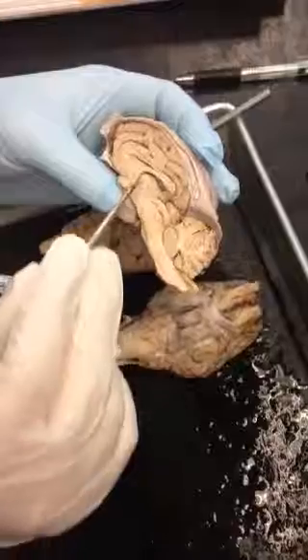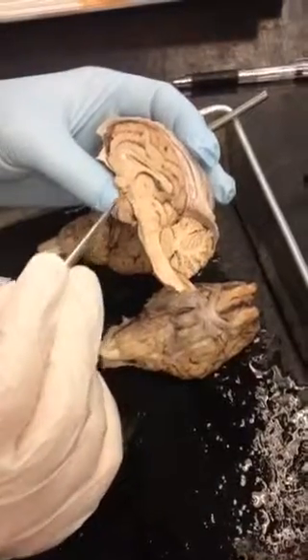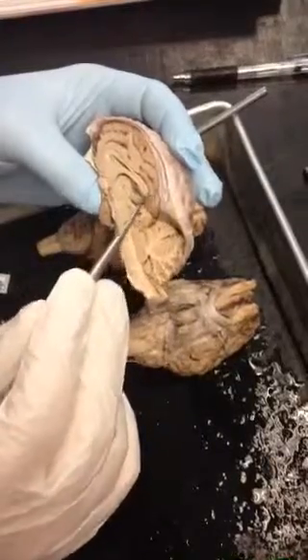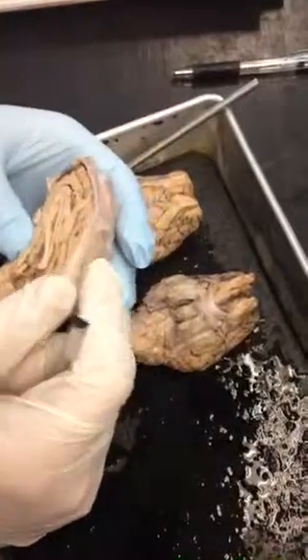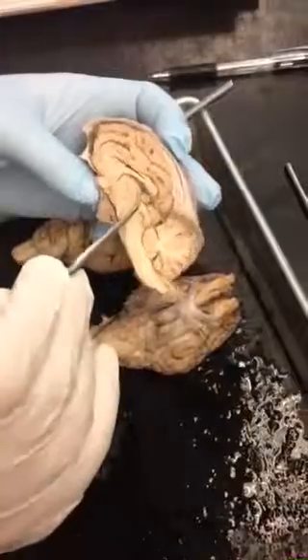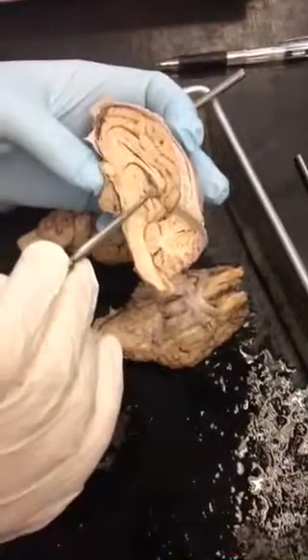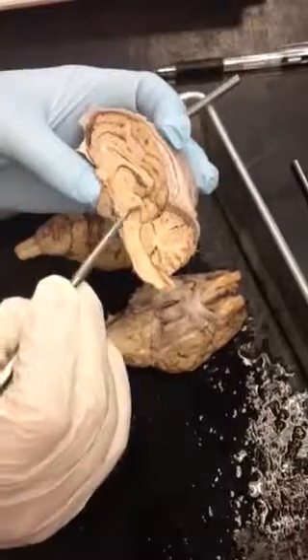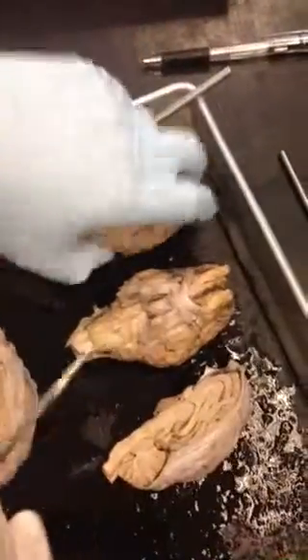Let's see, thalamus right there, hypothalamus, pineal body. That's part of it cut in half right there. The pineal body, and the superior and inferior colliculi. You can see them on a whole brain too.